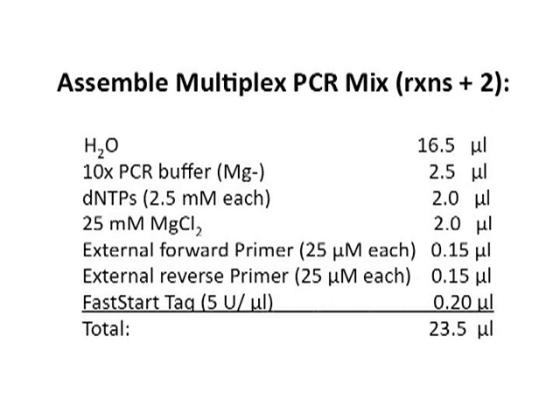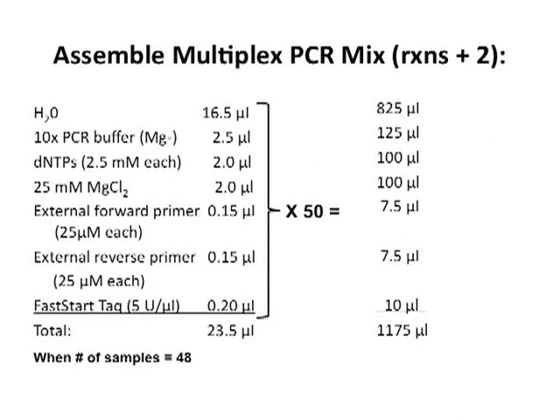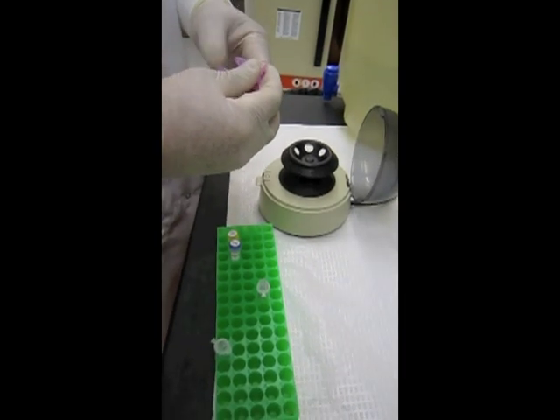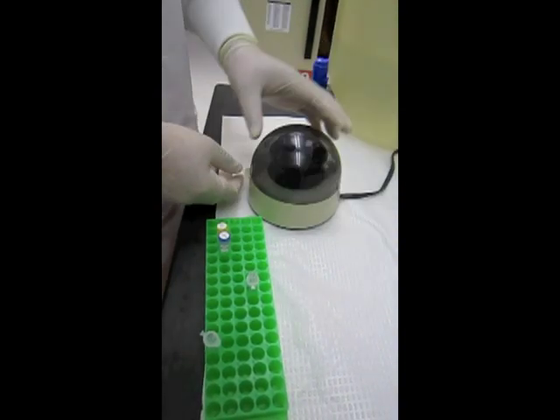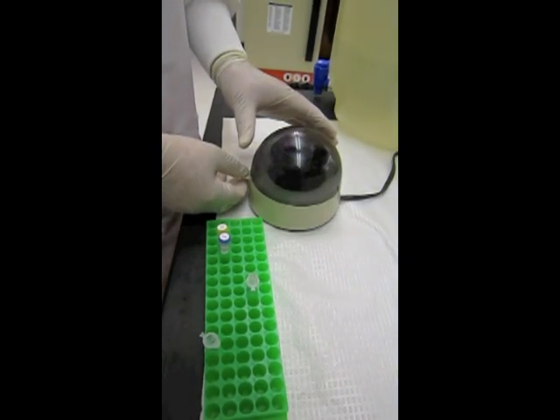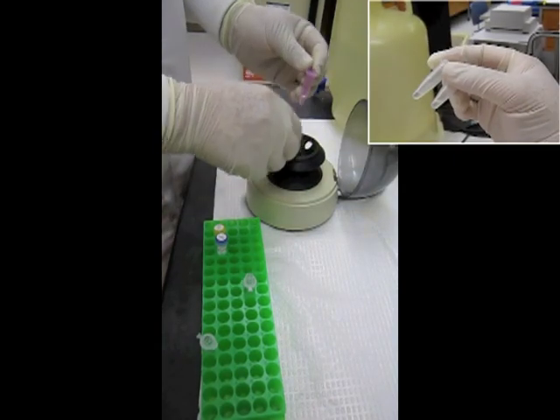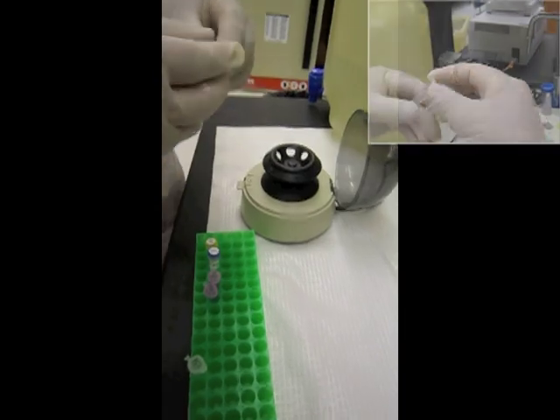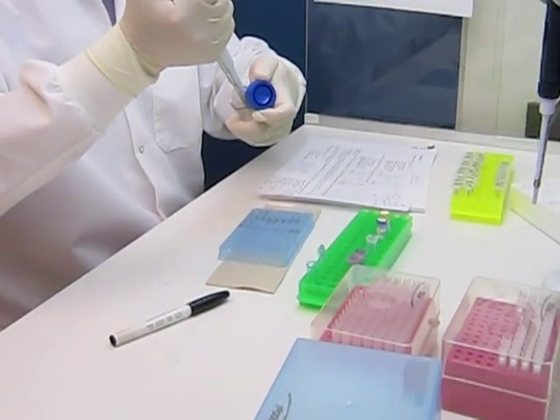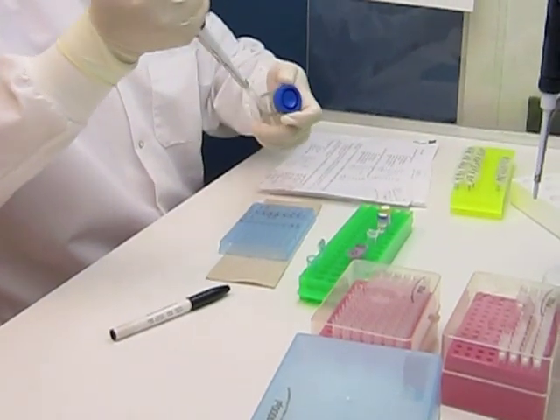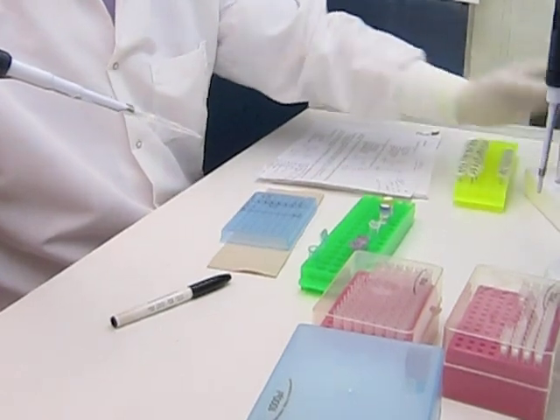Now it is time to assemble the multiplex PCR mixture. This list shows the amount of each reagent needed for one reaction or one well. It is good practice to prepare enough mixture for at least two extra reactions — so if you are running 48 samples, prepare enough for 50. When all reagents are thawed, mix each tube well and spin down briefly in a centrifuge to draw the liquid to the bottom and prevent contamination from splattering. Make sure to balance the centrifuge with tubes containing equal volumes of liquid. Add the proper amount of each reagent to a tube labeled multiplex PCR mix, adding the fast start DNA polymerase last.